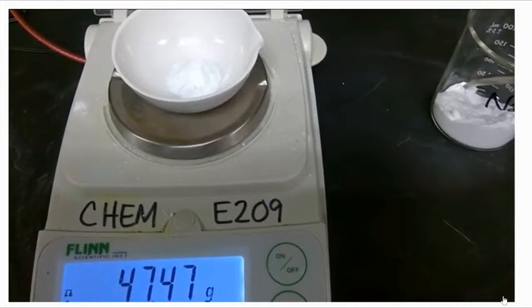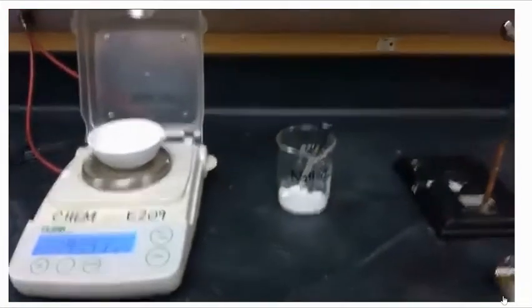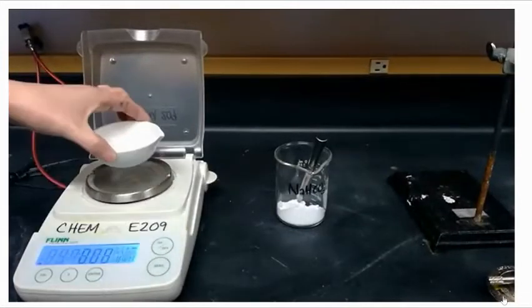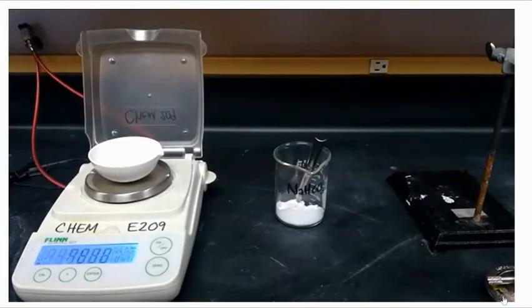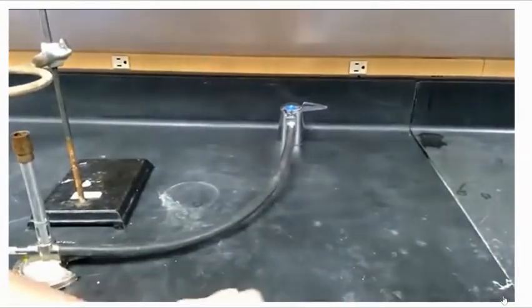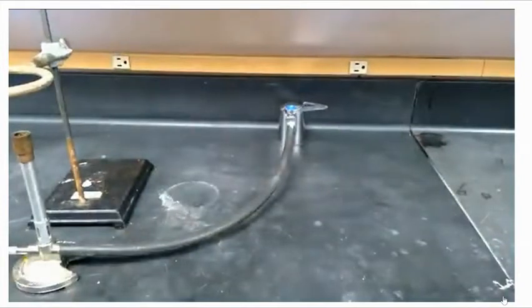We can see the baking soda is a solid white powder in the evaporating dish. And I'm just shaking it around to make sure that it's nicely evenly dispersed on the bottom of the evaporating dish so that it has the greatest surface area when heated.